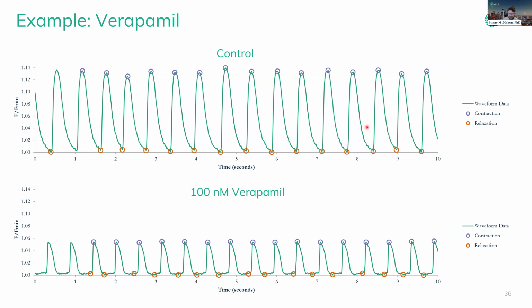It's also worth noting here that verapamil is known to be a false positive on in vitro hERG activity screens. So this makes verapamil a compound of significant interest for developing improved screens for hERG activity.